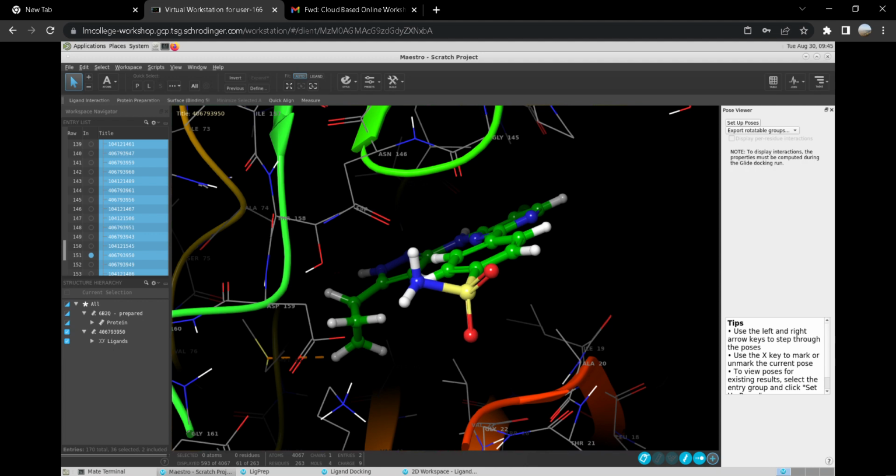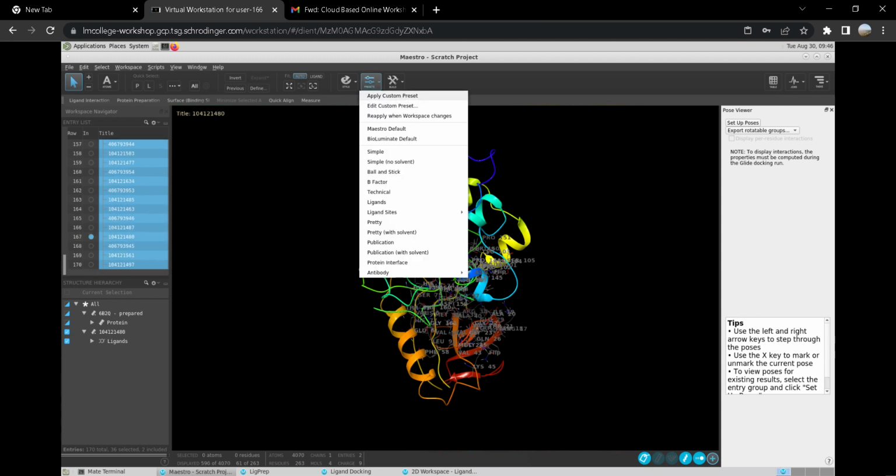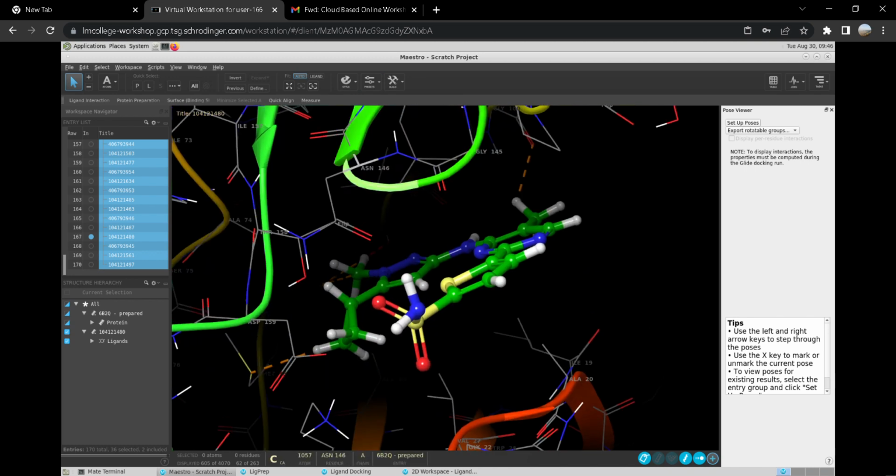Now, usually a molecule can be selected purely based upon non-bonding interaction. It can also be selected purely based upon docking score. In case you decide that your molecule should make these three key interactions, only those molecules will be selected, and you can do that too. So you need to compare this interaction with the native bound interaction and take a call on whether the molecule will be good enough to proceed further.